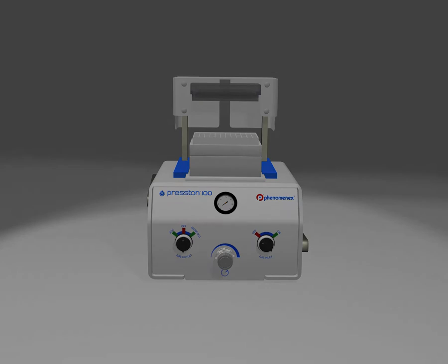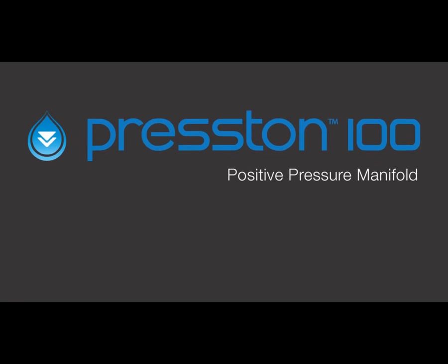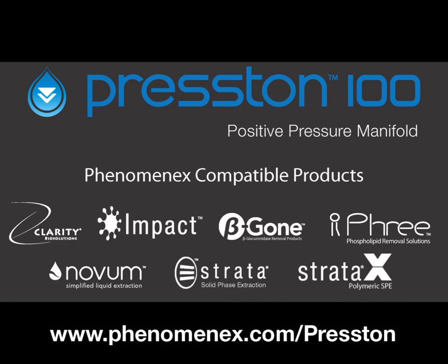To learn more about the Presston 100 Positive Pressure Manifold, as well as to view a list of sample preparation products that are compatible with Presston, visit www.phenomenex.com/Presston.